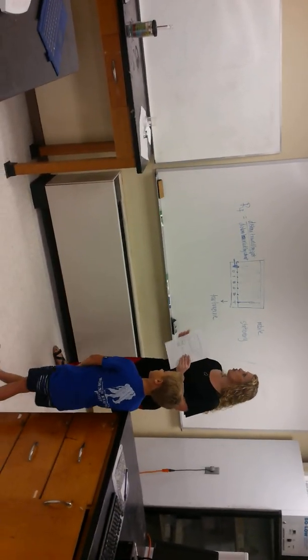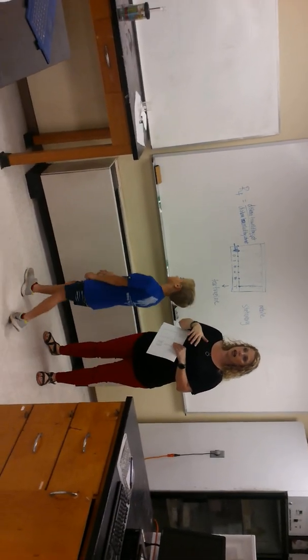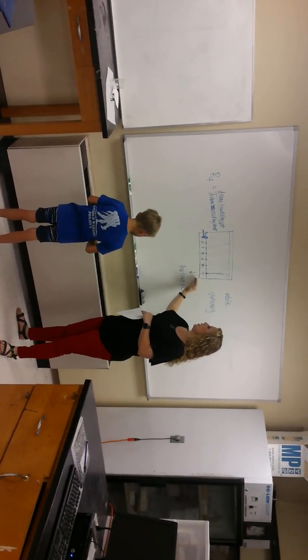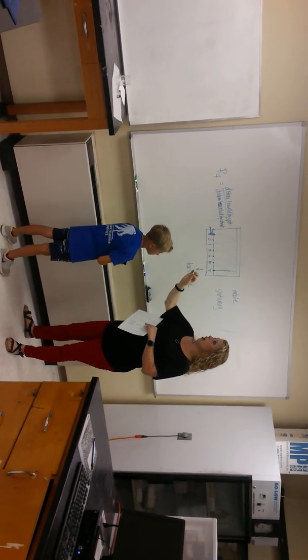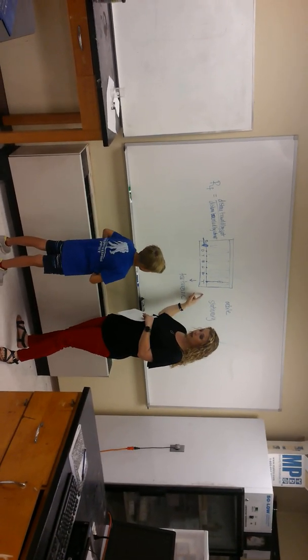Just be sure that you're really careful, that you're not pouring things, contaminating things. That's very, very important with this lab, because if you contaminate, you're going to see a lot of these all the way across. Again, you need a good, nice, concentrated dot, so that's very important, not putting too much stuff, and also being sure you get a concentrated dot there.